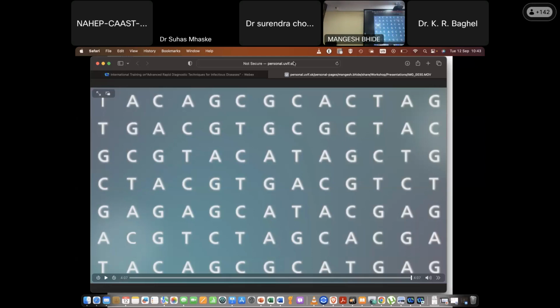There are different primers used for one species. So whether there is some unique location that should be sequenced when we do sequencing, or is there any criteria for sequencing? Suppose some variant which is more pathogenic, a virulence factor. Whether to target a particular amplicon or not.